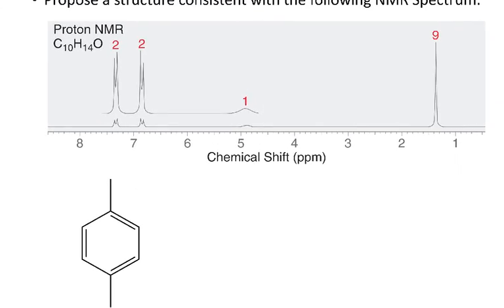So I have 2 more groups, and these are probably the groups, one above and one below. And I know I also have an oxygen, and I can see that the oxygen is not split, so that leads me to believe it's probably an OH.